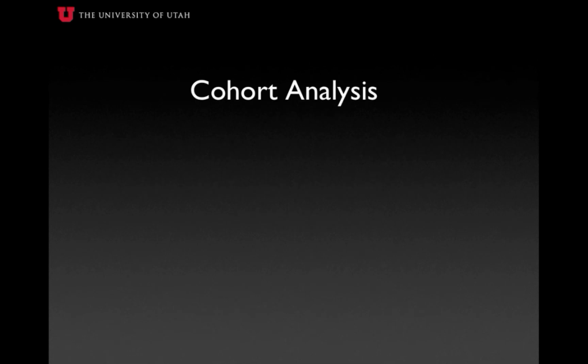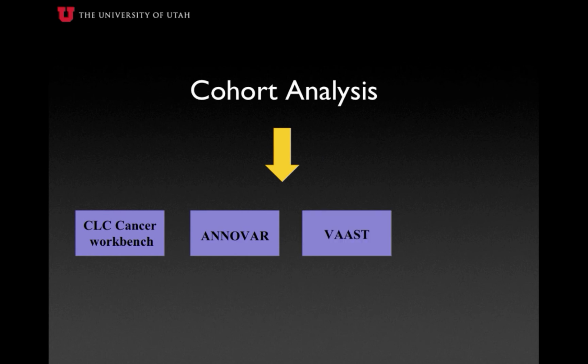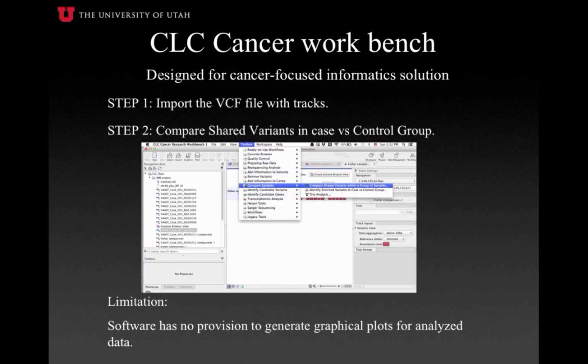Cohort analysis. For cohort analysis, we chose 4 different software packages available. First one being CLC Cancer Workbench, second one ANNOVAR, third one VAST, and then VAAST 2. The VAST results were actually input for the VAAST 2 analysis.